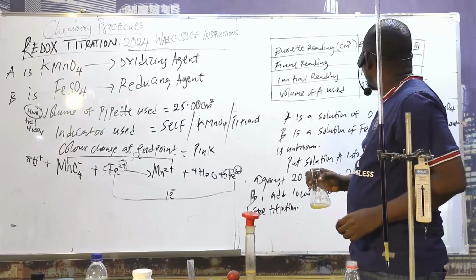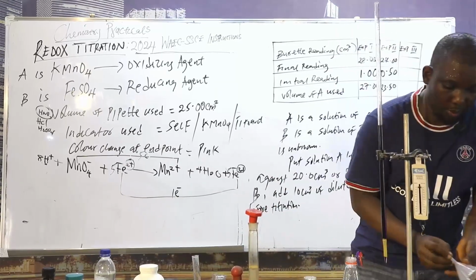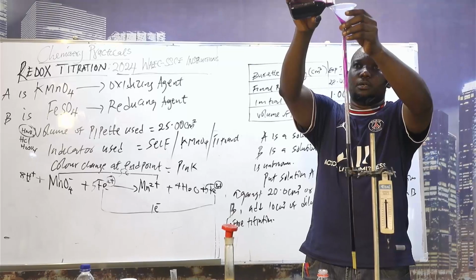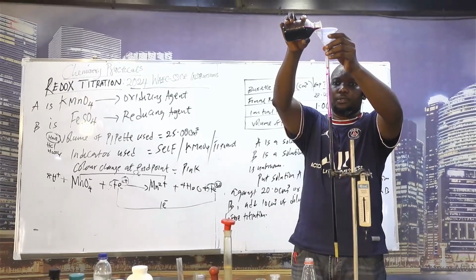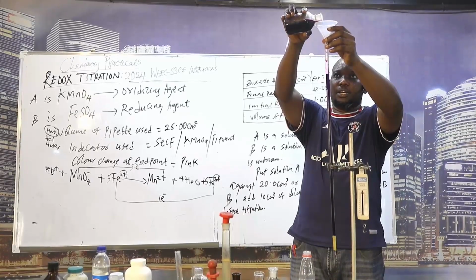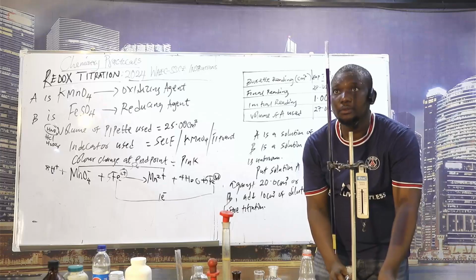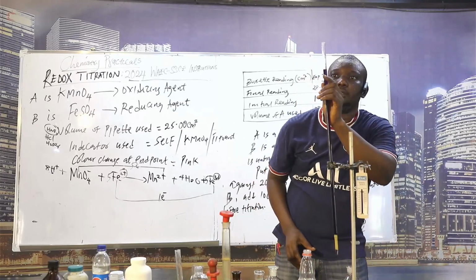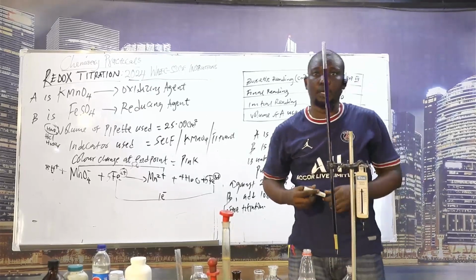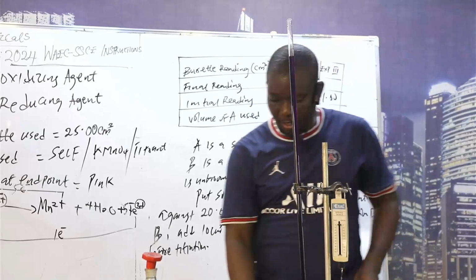To avoid any case of using the last final as initial, please refill. Refill. Okay, I think I'm on 1 point. 1.00. Okay, we start the last one.